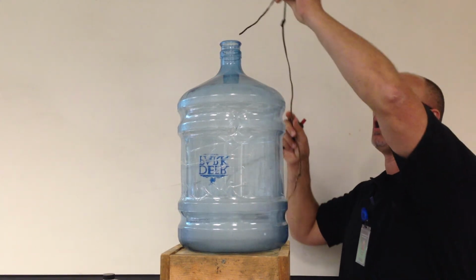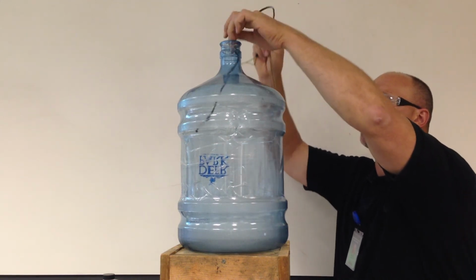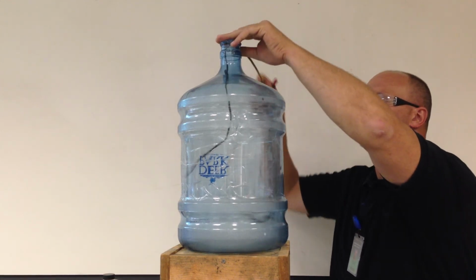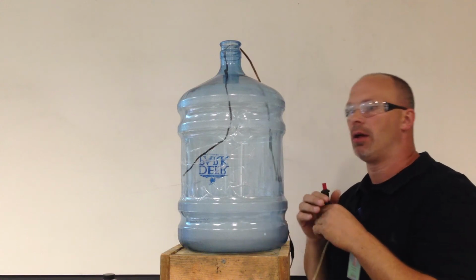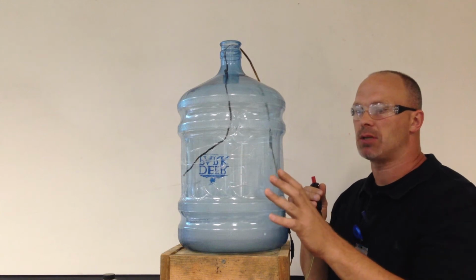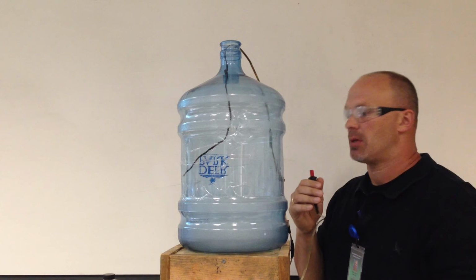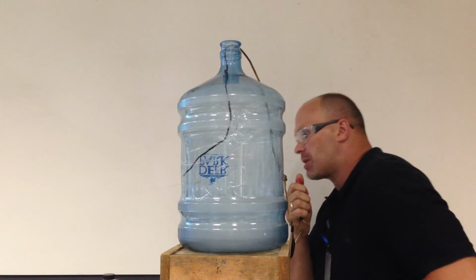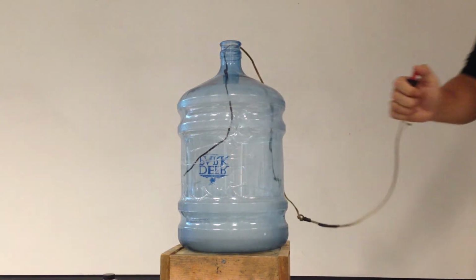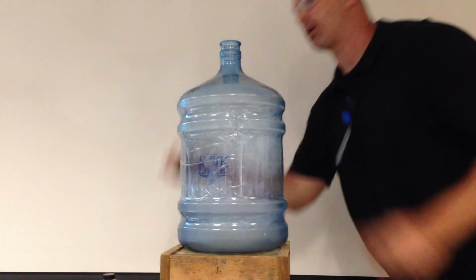Okay, so in any case, I'm going to put this sparker in here and try not to get the end wet. And my hope is to react the oxygen with the alcohol. Now I've taped this with clear tape because sometimes, 1 out of 100, these actually will explode. So this could be a dangerous result. So I've definitely taped it to make things safer. So here we go. I'm going to step off to the side. I'm going to light this, and I have an extra part to this. So here we go. 1, 2, 3. And I'm going to quickly cover it.